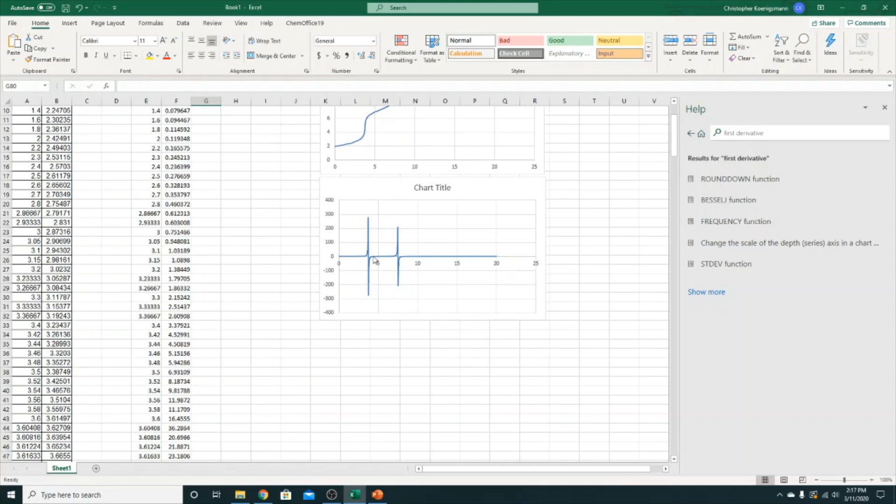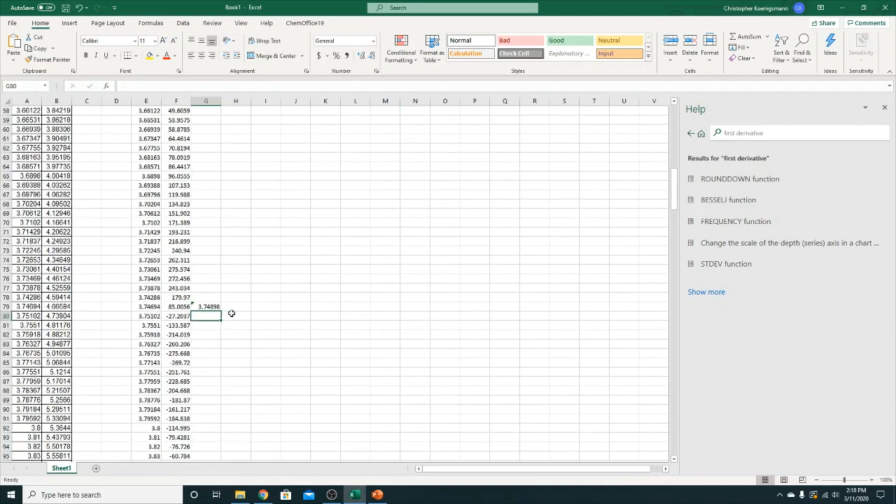Now, another way of doing it that Dr. Feruznia suggested to some of his sections was, you can fit this straight line to a line equation, and then using a bunch of data points, actually figure out where it crosses zero. Either one is fine, but the average might be a little bit more straightforward to do while you're off at home without us to help you. So that's how I would do it. So this tells me that the first equivalence point in my data was 3.75.